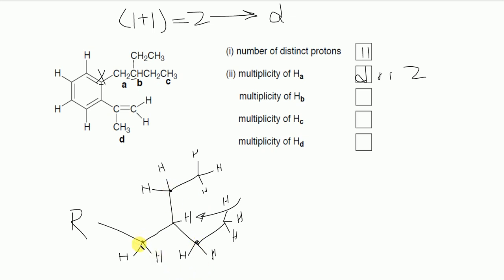Okay, and I add up the adjacent hydrogens, and then I do the +1 thing, and I multiply them all together and get some big number. But we have to be careful here, so let's do this one at a time. So the parentheses for this one is going to be 2 plus 1.